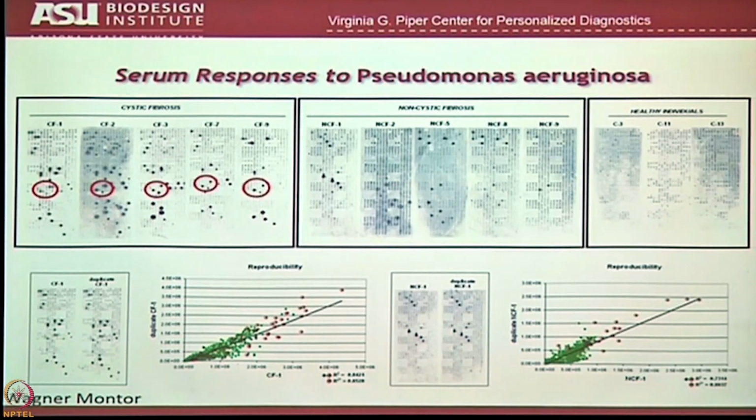This is just to show you that the responses were very reliable from chip to chip. And if you start looking carefully at this, you'll start to see a pattern emerge. Certain features show up over and over again. So that pair there is there, it's there, it's there, and there. Those 2 spots are the same protein. Everybody's there in duplicate. They show up repeatedly. That's a sign that that particular protein is what we call immunodominant.